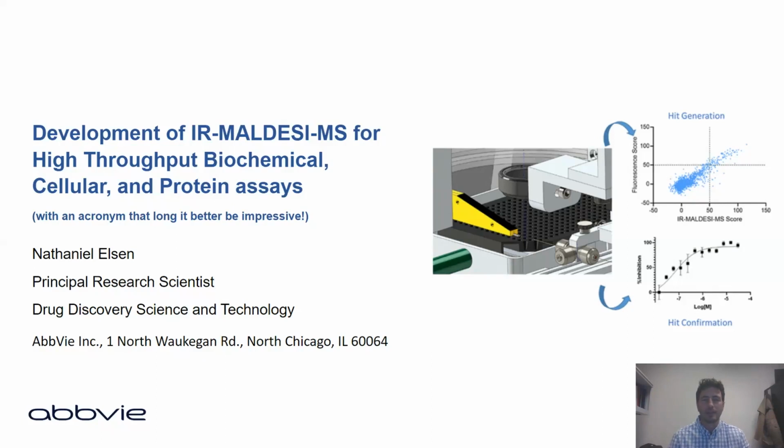And today I'm going to talk to you about a new technique we're working on, mass spec analysis of high-throughput biochemical, cellular, and protein assays. So thank you for inviting me to speak.